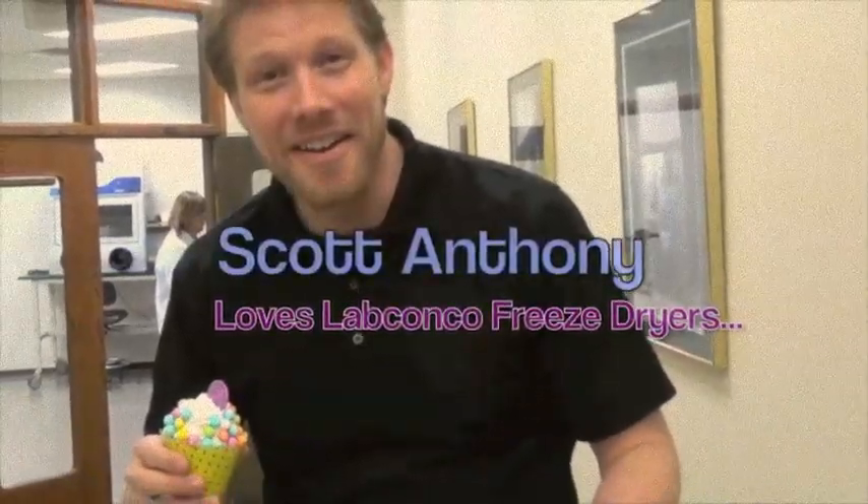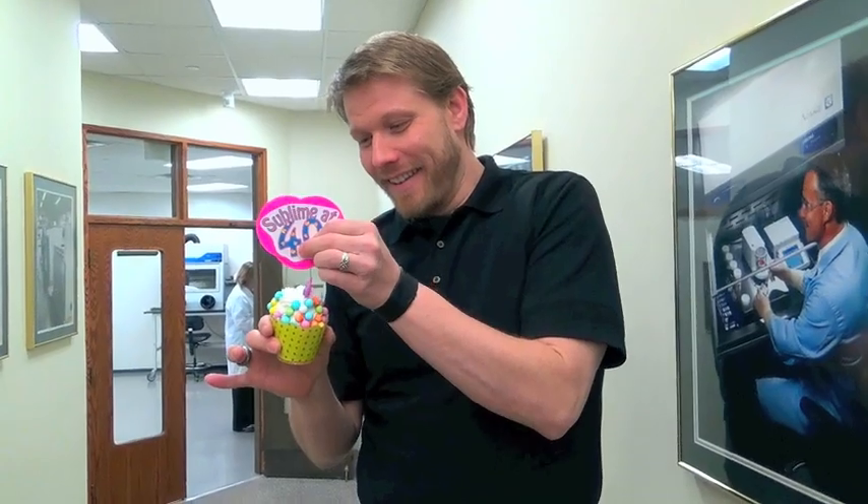Hey, how's it going? I'm glad you could come. So the Lab Conco freeze dryer is turning 40, and I want you to come with me because we're going to give it a cupcake and celebrate its 40th birthday.